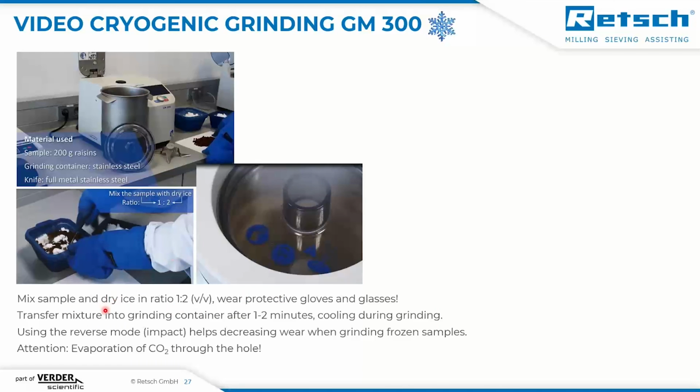Then you have to wait for 1 or 2 minutes until the sample is pretty cold, transfer the complete mixture to the grinding container and start the grinding. As I said before, the sample now is hard frozen, so you cannot cut it. So it makes no sense in the first step to use the sharp side of the knife. So you go just in the reverse mode and use the blunt end of the knife to have impact and to crush the sample in the first step. And then in the second step, use full speed with the sharp side.